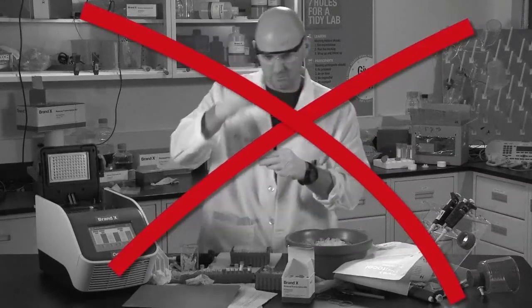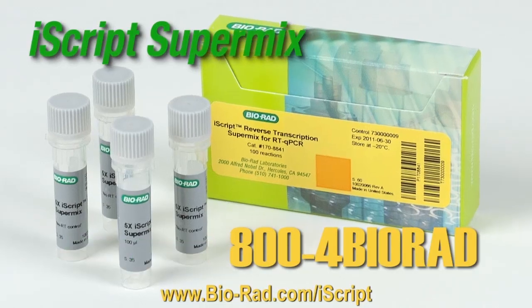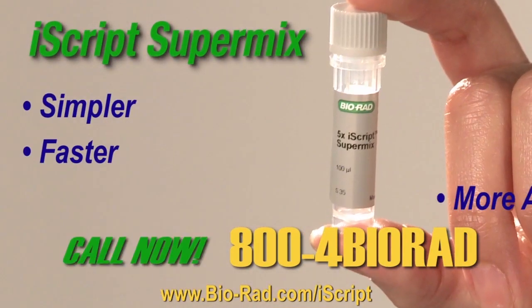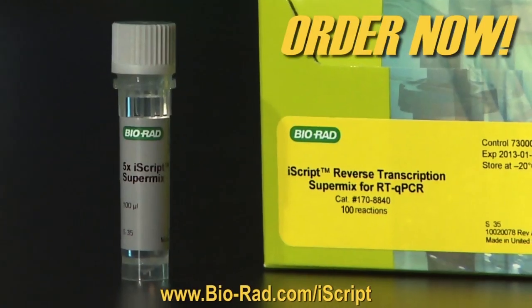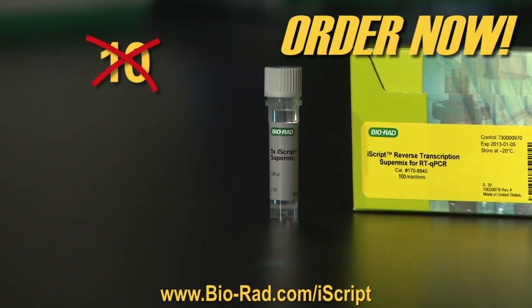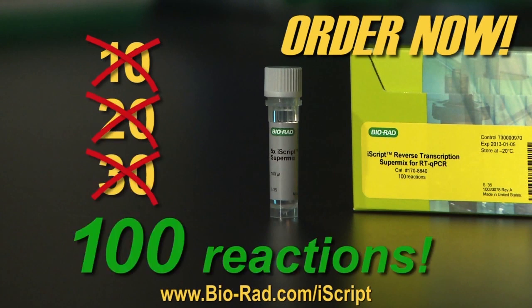So don't wait! If you'd like to spend less time at the bench performing fewer steps, order BioRad's iScript SuperMix today for simpler, faster, more accurate results! Order now and receive this incredible one-tube SuperMix that's good for not 10, not 20, not even 30, but 100 reactions!